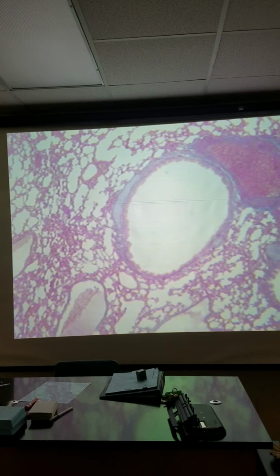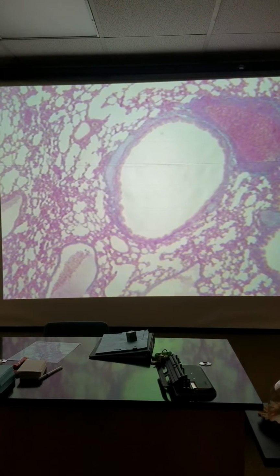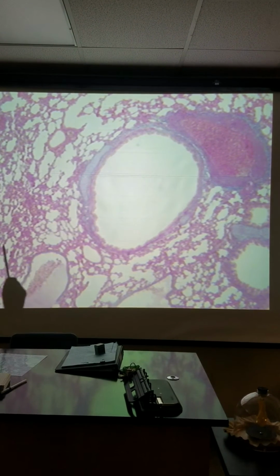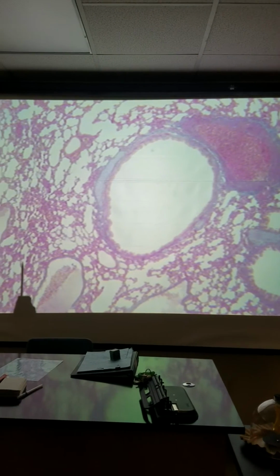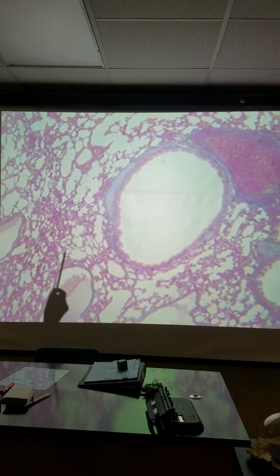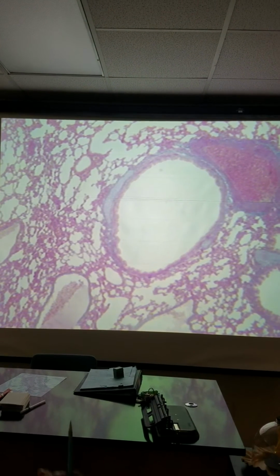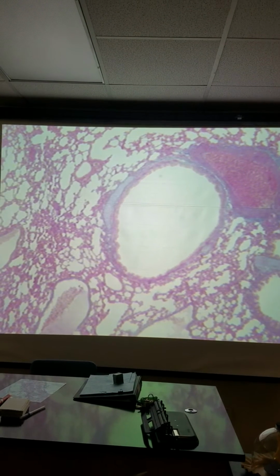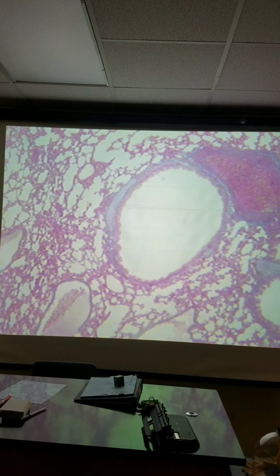Okay, so the majority of those little web-like structures are the alveoli. They are composed of simple squamous epithelium. This is where gas exchange occurs. Don't worry about whether it's a type 1, type 2, which one makes surfactant, that's more lecture. But these are alveoli. So look, when you see all these alveoli, now you know you're in the lungs. And once I'm in the lungs, the only other vessels, or not vessels, but tubes you have to identify is the difference between a bronchi and a bronchiole.